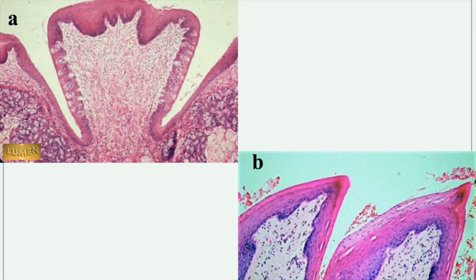The papillae in this picture are characterized by being surrounded by a groove, confirming they are circumvallate. The presence of many taste buds confirms the diagnosis, as does the presence of glands underneath. In contrast, the filiform papillus is the only type devoid of taste buds and covered with keratin.